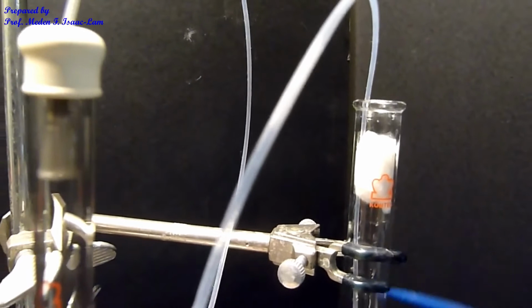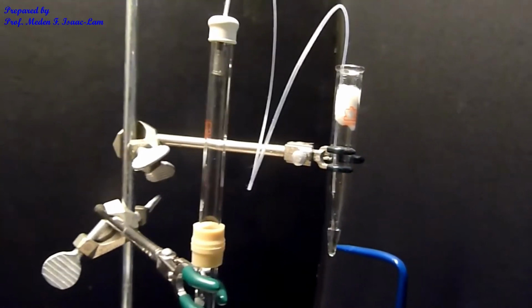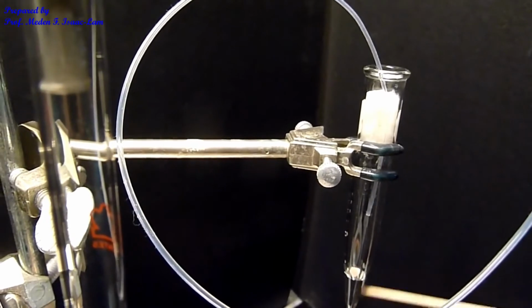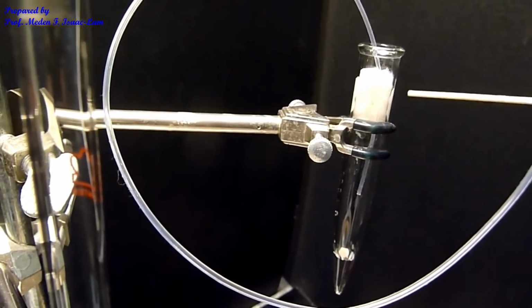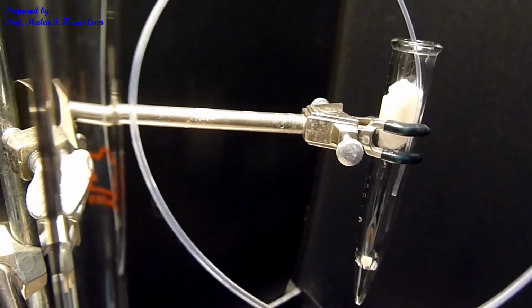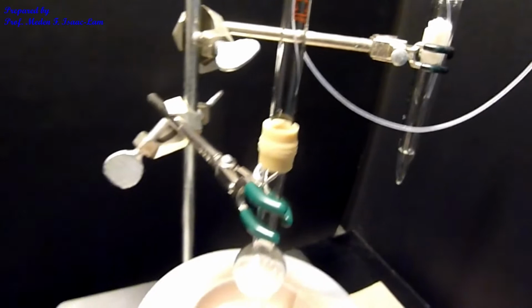So I don't want the end of the tube to be immersed in that water, because there's going to be a back pressure. So the HBr gas will get absorbed into the water. It's just basically acidic. And then, so I want to trap it so that it's not like all over. And I'm also under the hood. So let me repeat it.